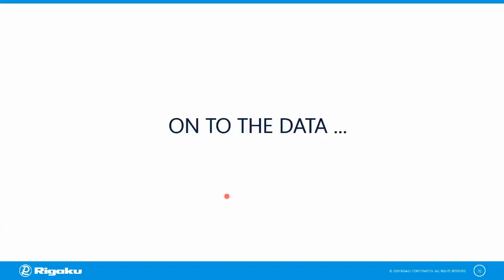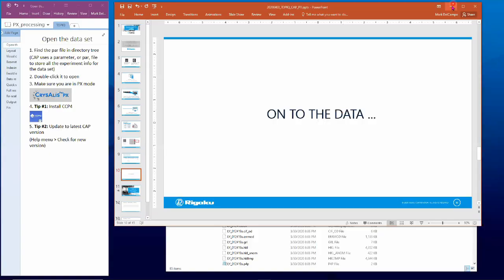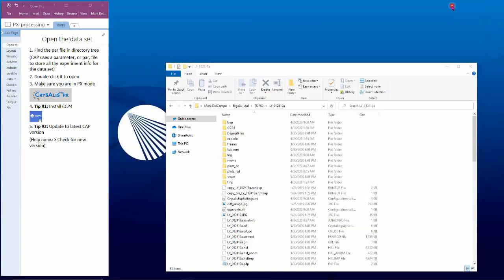So now let's get on to the data and the tutorial. Let me just give you a word about how we're going to organize the webinar. On the left-hand side of the screen, you're going to see the topics that we're going to cover on the top, followed by step-by-step instructions of what we're going to do.